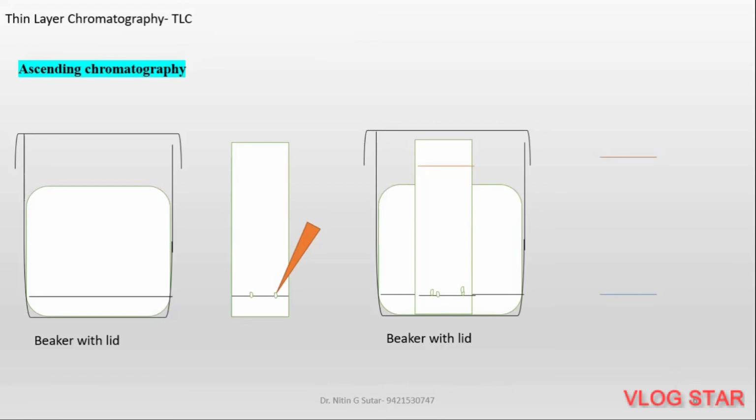Just check the two spots, how the components get dissolved and how they run. Yes, some of the components are left behind, and some of the components which get dissolved run. Here also you have to check this. I showed it here separately, but actually this is a simultaneous process. The mobile phase runs, and along with that the dissolved components also run. But to help you understand, I show it separately.